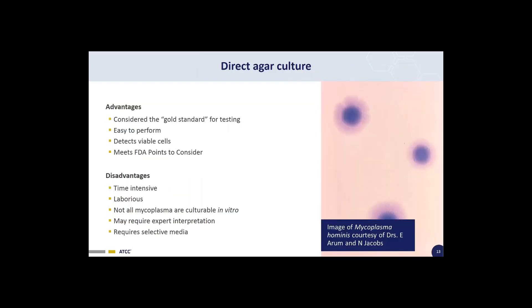The direct agar culture method uses both broth and agar, which permits the isolation of culturable strains as apparent by the appearance of characteristic mycoplasma colonies on the agar medium. Two agars and one broth tube are inoculated for each sample, then incubated and subcultured for specific days. Results are read separately by two individuals. Advantages include that it is the gold standard for testing, easy to perform, detects viable cells, and meets FDA points-to-consider recommendations. Disadvantages include that the assay is time intensive, laborious, not all mycoplasma are culturable in vitro, it may require expert interpretation, and it often requires selective medium.